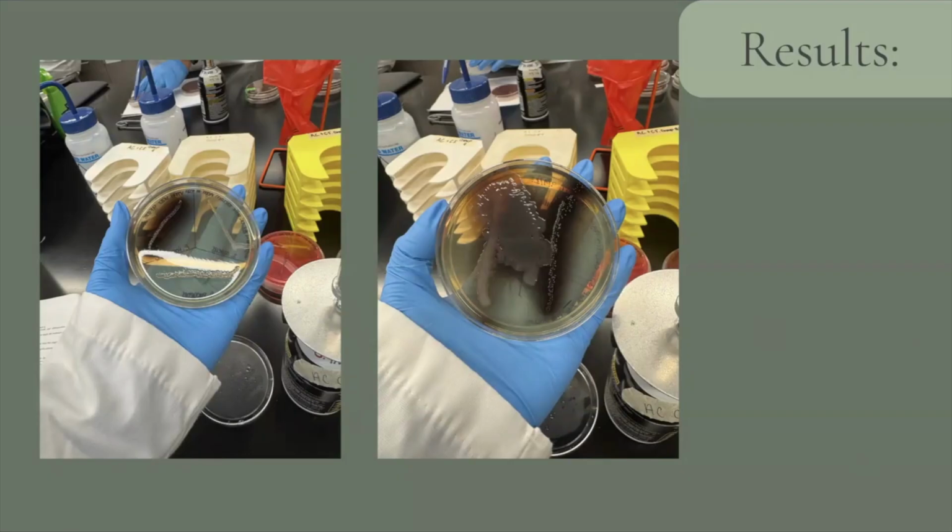And for unknown 294, we see lots of growth, as you can see, and it kind of smeared into the other side. There's lots of growth, but there's no blackness. There's some brownish precipitate to it, but we still interpret that as a negative result.